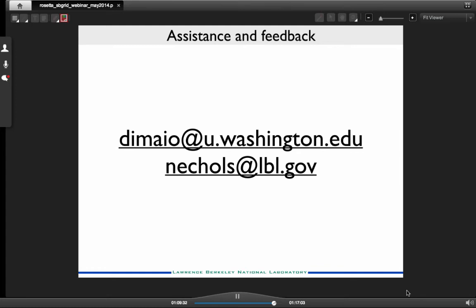Okay, thanks a lot, Nat. We already have a question here from the chat box saying, is the Phenix-Rosetta Refine fully supported in all versions, including the macOS versions of Phenix? Yes, it should work fine on macOS. Somebody reported issues, but at least on my computer, it seems to be running. It does not work on Windows. Rosetta just doesn't do Windows right now. I don't know if and when that'll be fixed. I would say if you're running Windows, you probably need a more powerful computer anyway to really run this program effectively.